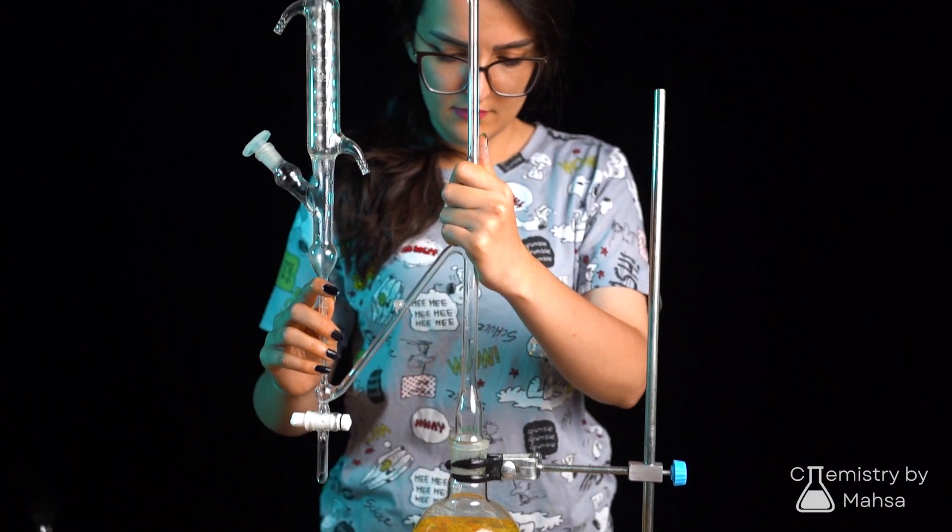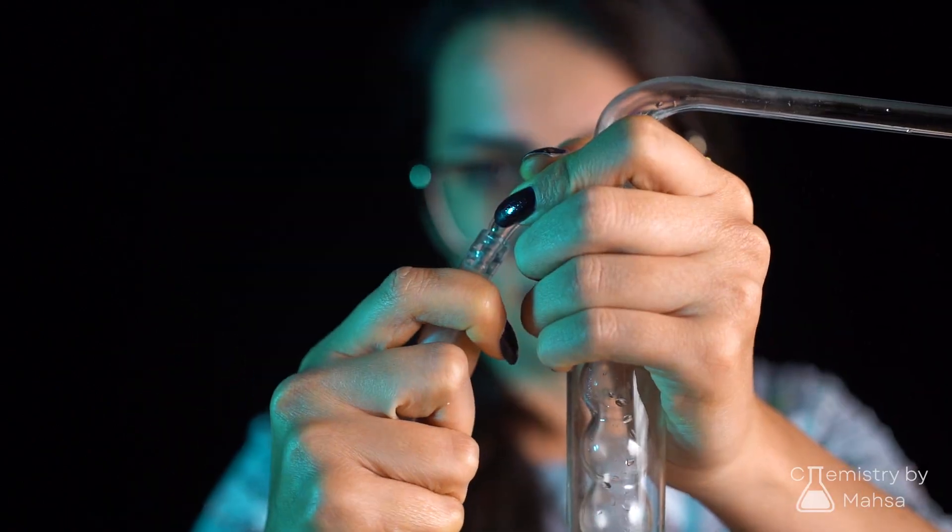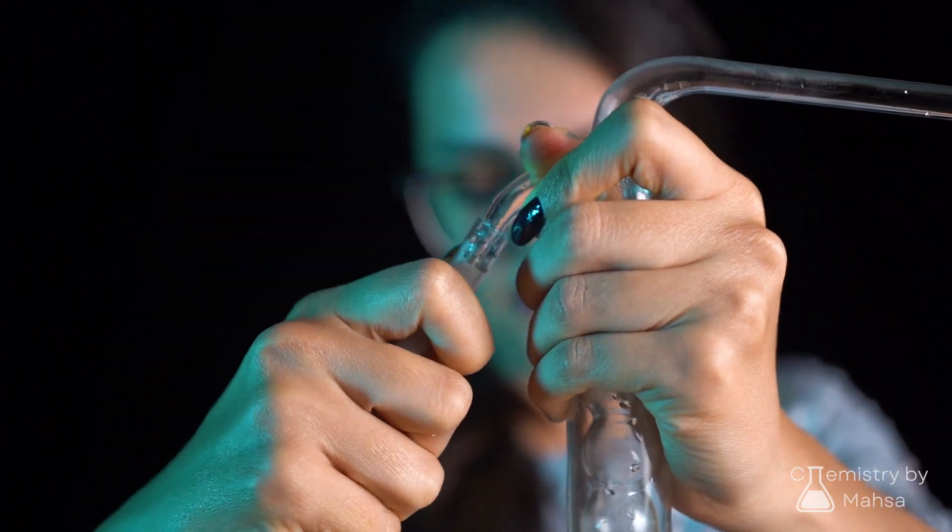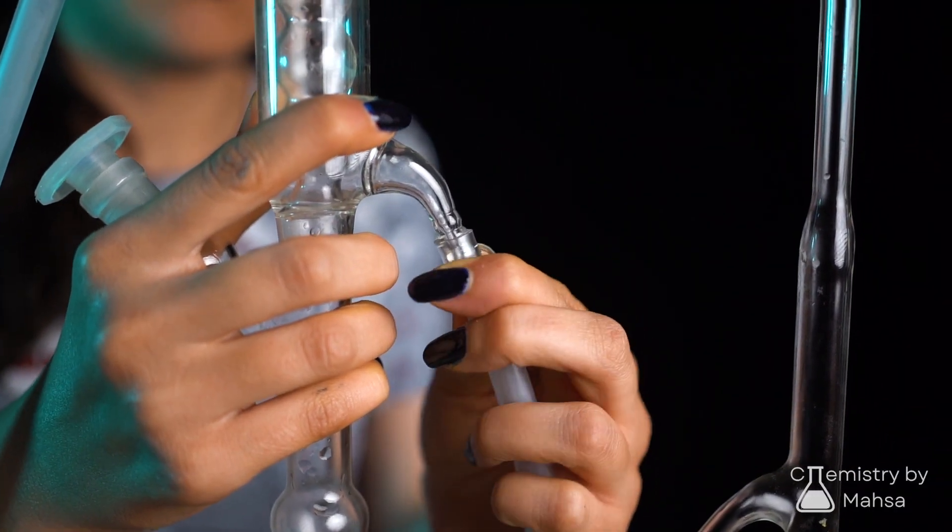For the next step, the apparatus was set and checked for the seals to be completely fit. Then the silicone hoses should be attached, and again make sure to have them fit so there won't be any leak in the middle of the process.